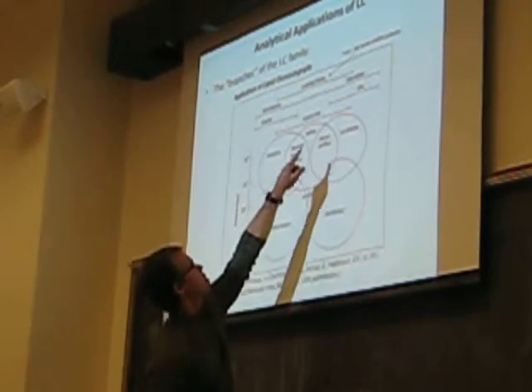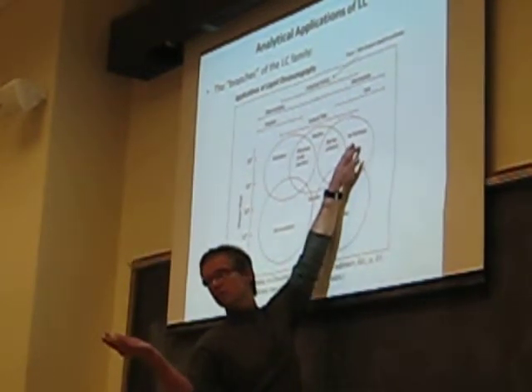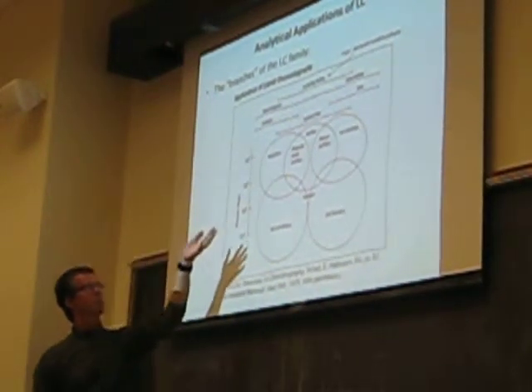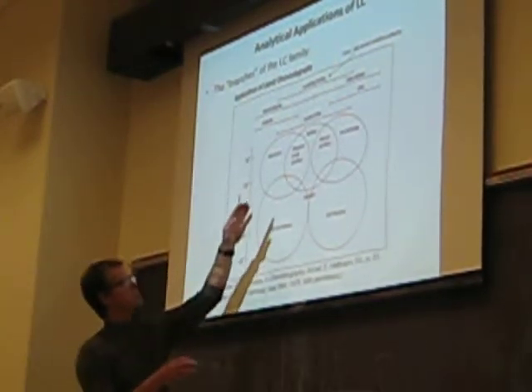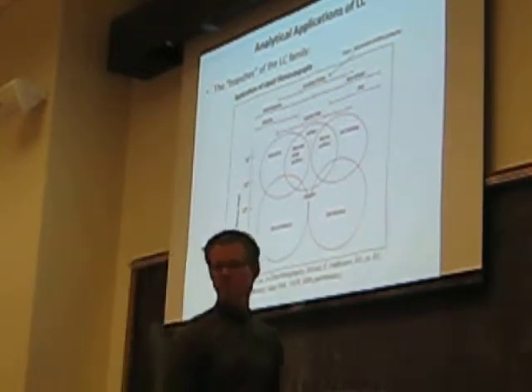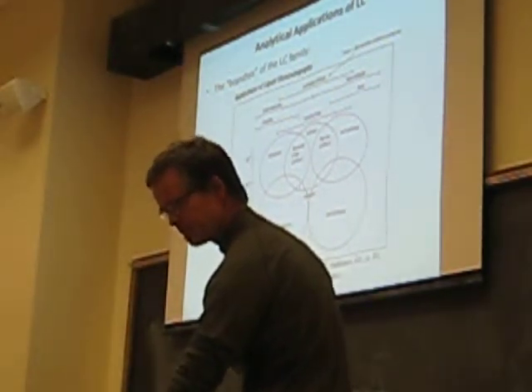And if it's polar, or highly ionic, then you do the opposite, like you guys are doing, because you can probably use some kind of ion exchange. So you can have a little graph like this and say, all right, my analytes are kind of like this, and about this side, it looks like I should be using such-and-such, right? People actually do that, use figures like this to help consider what additional approaches you can use.